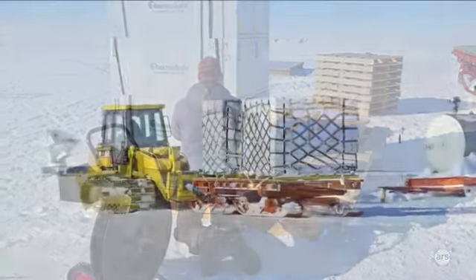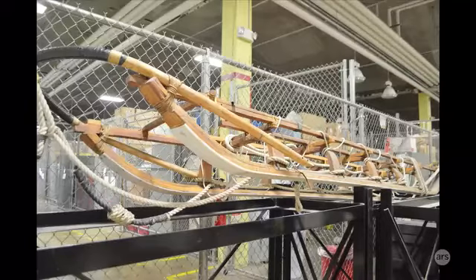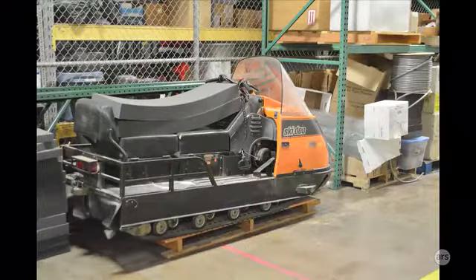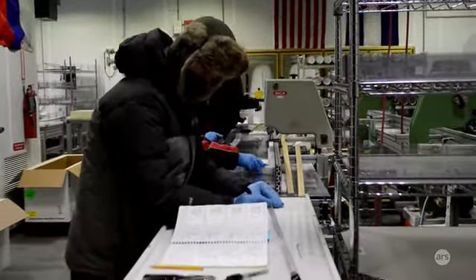What's even scary to think about is not how much it weighs, but how much it's worth. That's why we're so careful about every one of those boxes. We put a temperature logger in. We have somebody actually sit on the plane and ride with it back to the station to make sure they keep the plane cold enough. But if you think about how much time and effort and money went into these projects, it's absolutely necessary.